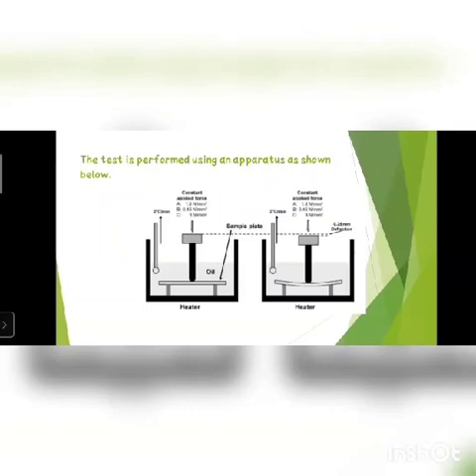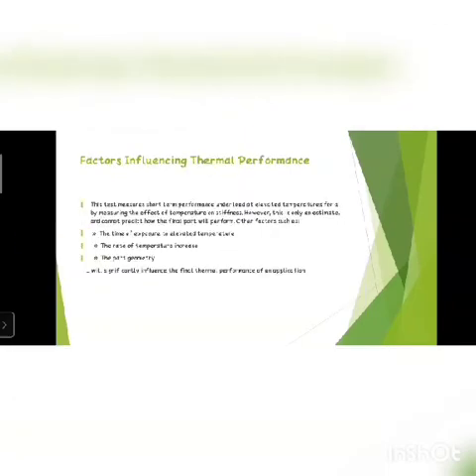This is the diagram of the apparatus. As we can see, there is oil in the container, we are heating it, and a load is applied on the needle. Factors influencing thermal performance: this test measures short-term performance under load at elevated temperature by measuring the effect of temperature on stiffness. The time of exposure, the rate of temperature increase, and the part geometry will significantly influence the final thermal performance of an application.